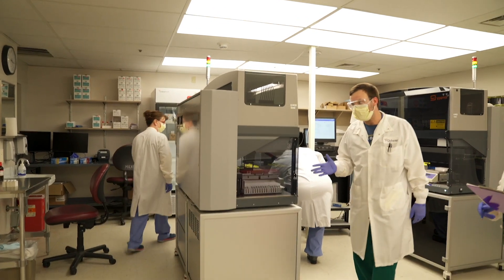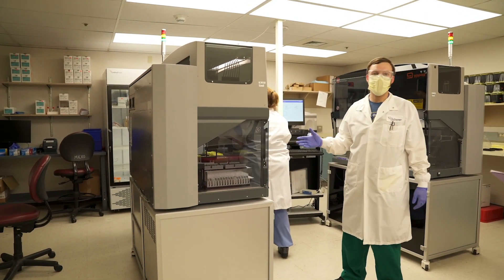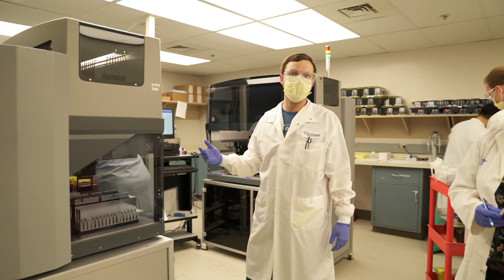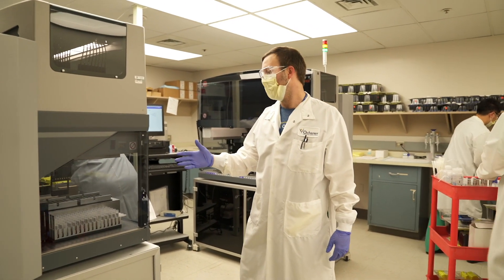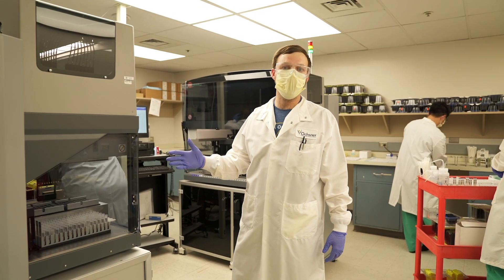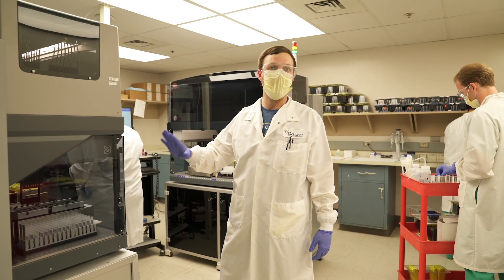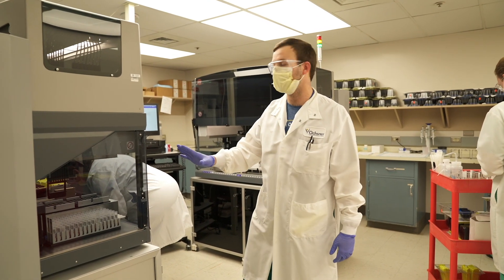This is our liquid sample handling. What this allows us to do is process a high throughput of samples accurately and precisely. Most hospital labs or even research labs are doing this process manually, which is what is taking such a long time for these tests to happen.